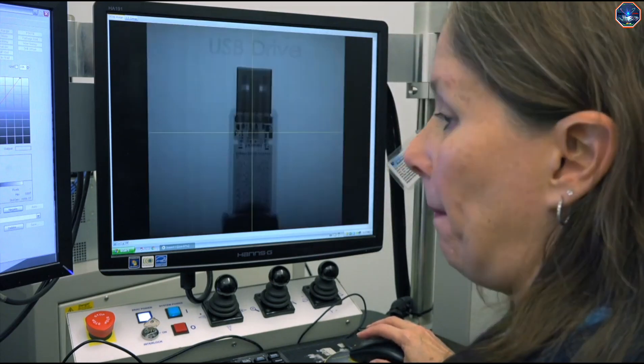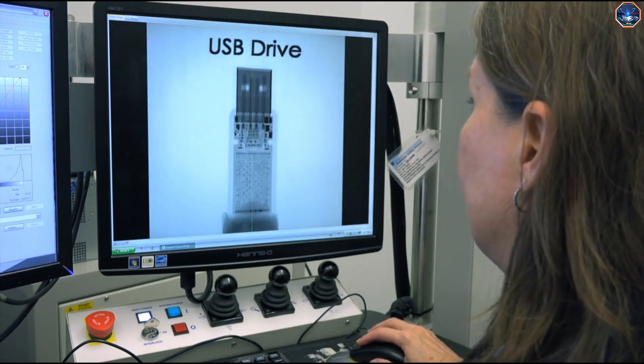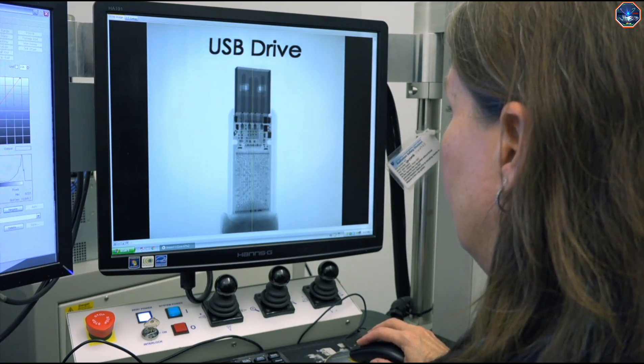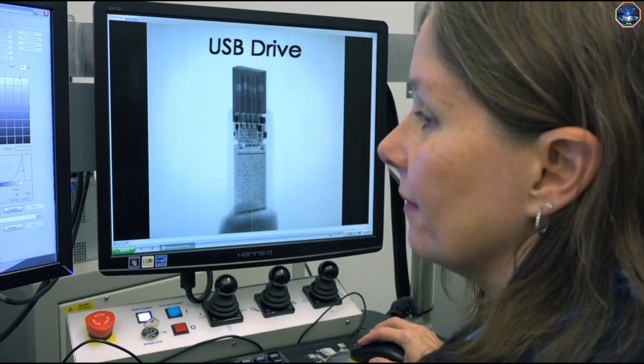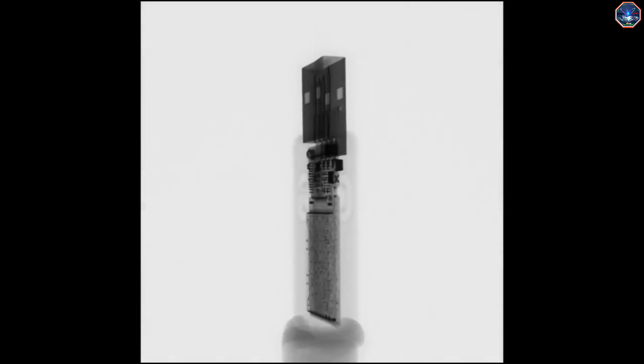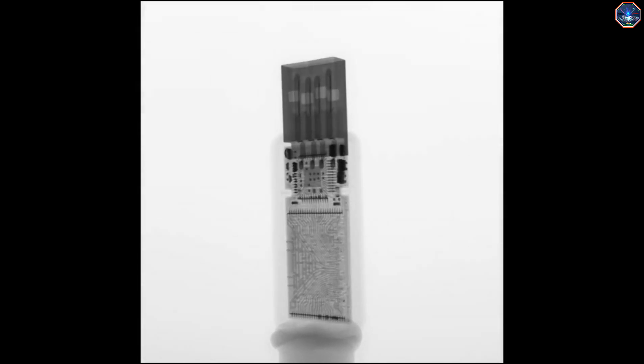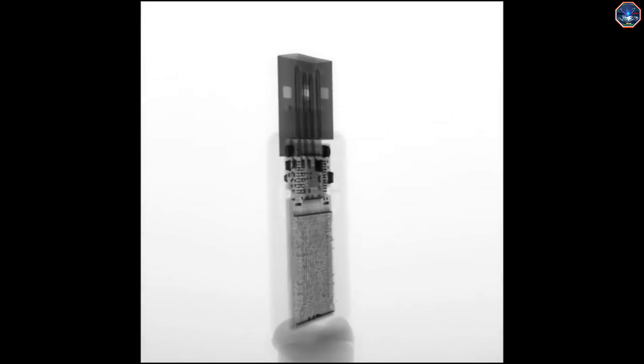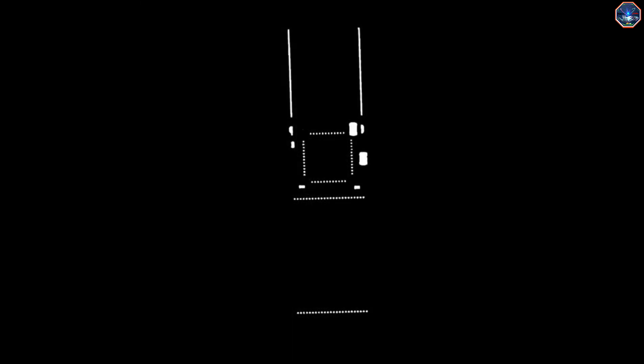Darker areas in the image are where x-rays are absorbed by the dense areas of the sample. Brighter areas indicate regions where the x-rays pass through the sample. However, in the final reconstructed cross-section images of MicroCT data, this black and white color pattern is flipped so that white areas represent dense and black areas represent less dense material. This is much like what you would see in an x-ray at a doctor's office.